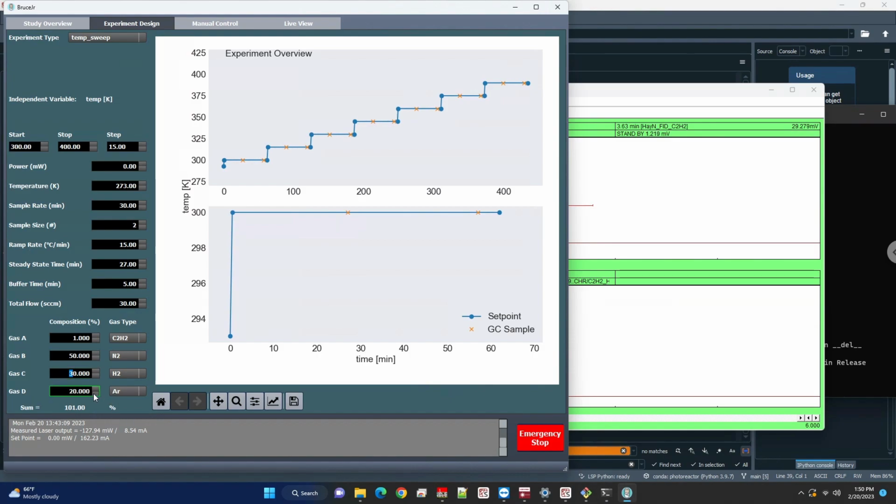You'll come back to look at the status of your experiment, and there'll be an error message, because it checks before it starts to run that these values equal 100%. But right now, the GUI itself doesn't do that checking. So the easiest way to get around this is that we just print out what the value is. You want to make sure that you're putting in something that adds up to 100% before you start the study. So that's how you plan out one experiment.